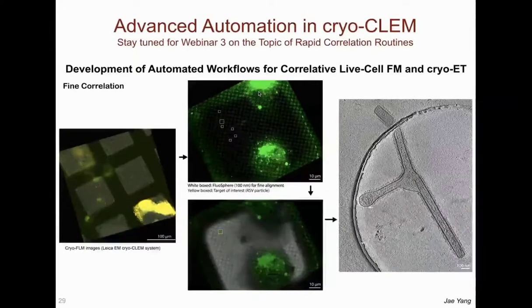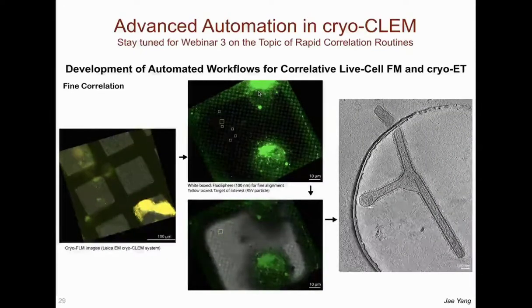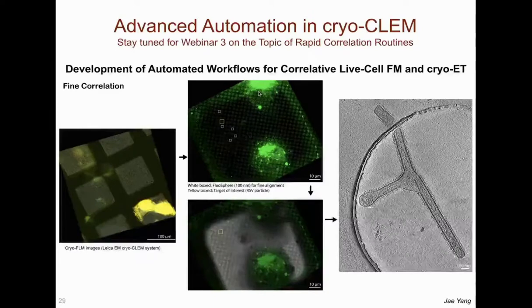In this webinar, we have presented details about the practical hands-on aspects of cell culture, EM substrate micropatterning, and cryo-CLEM. In our next webinar, to be held in August, we will present a robust correlation software solution with a user-friendly graphical user interface that seamlessly integrates with any LM and EM instrument.